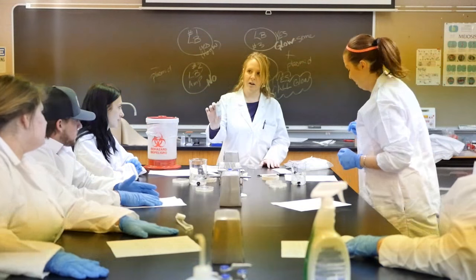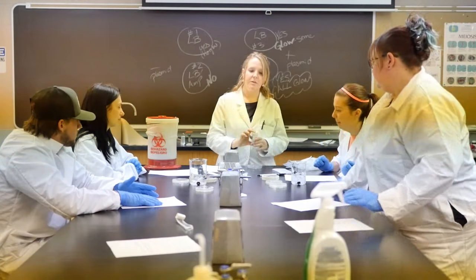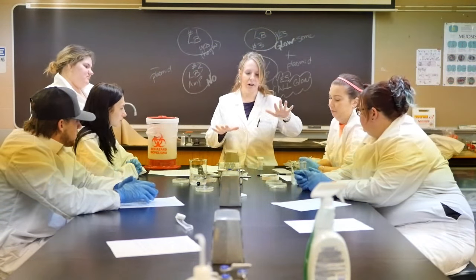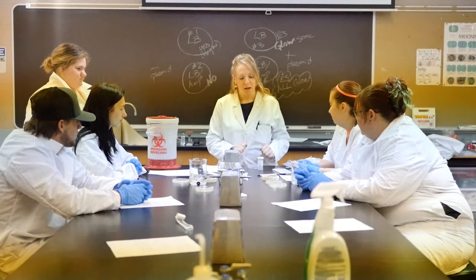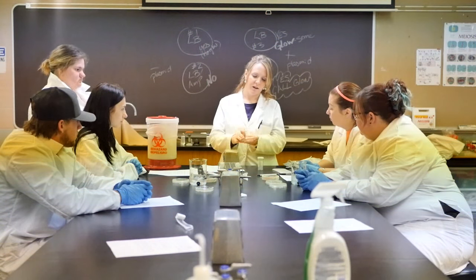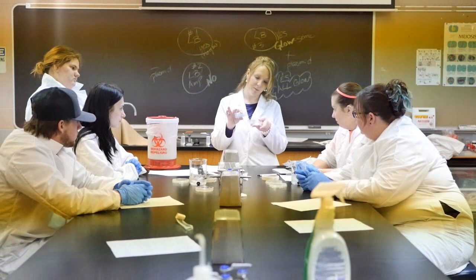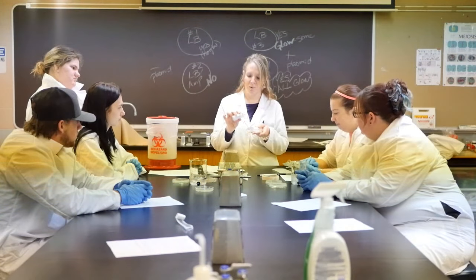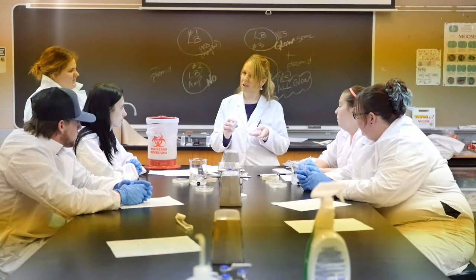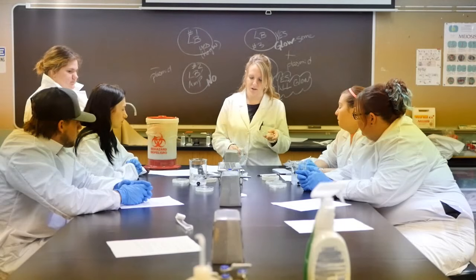So these glass beads are sterile. We're going to use these as a way to spread the bacteria out across the surface so that they all have a nice even way to grow. You're going to have your plate and open it up just enough to put in some beads. Be very careful when you do this because you could dump the whole thing in there. Just try to dump 4 to 6 beads onto the plate. Also, be careful because they do tend to bounce.